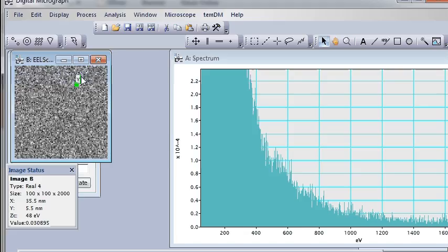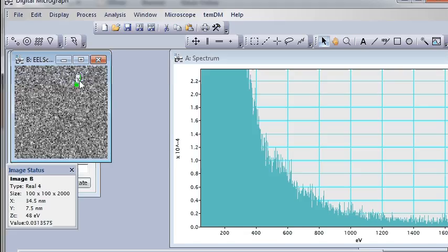Of course, it's very noisy. That's because by default this pointer chooses only one pixel.